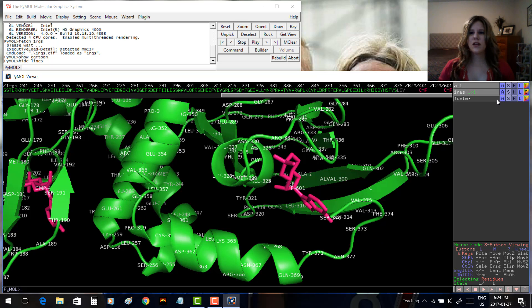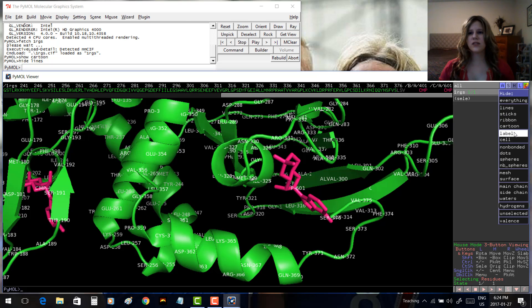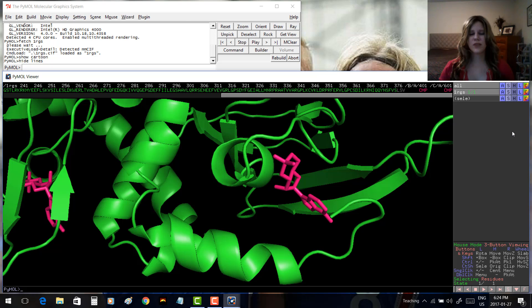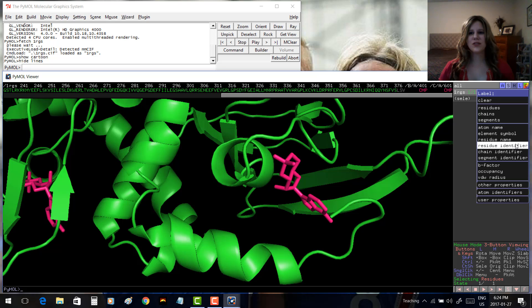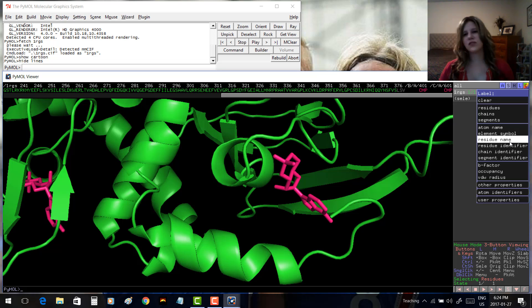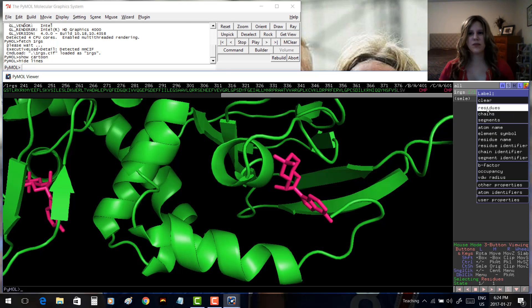To hide the labels, go to 1RGS, click H for Hide, and go down to Label. We could also label differently — under L for Label, you can label the atom name (very helpful when looking at a ligand), the residue identifier (just the number), or the residue name (just the name, no number). Usually, labeling by Residues — which gives both the name and number — is the most useful.